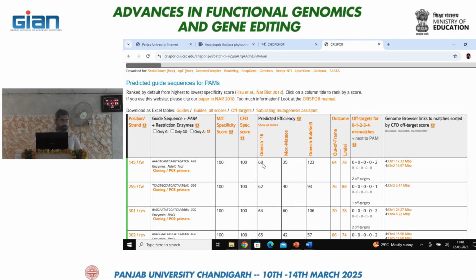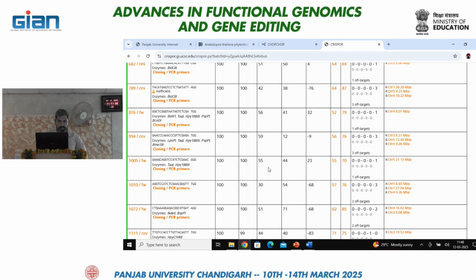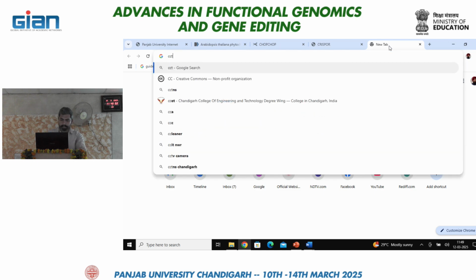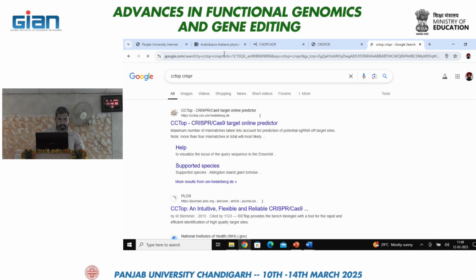So this was all about this tool, and one more tool I want to show you is CC top. You can just type CC top CRISPR and you can select the first link.